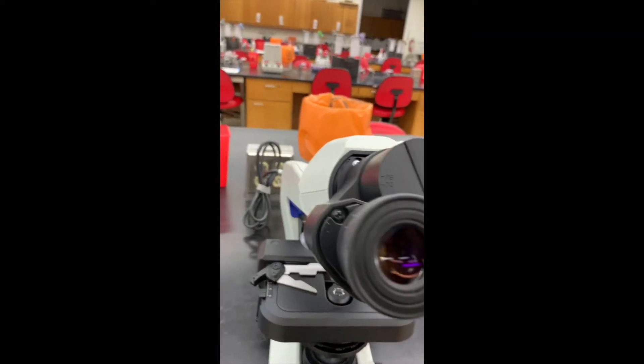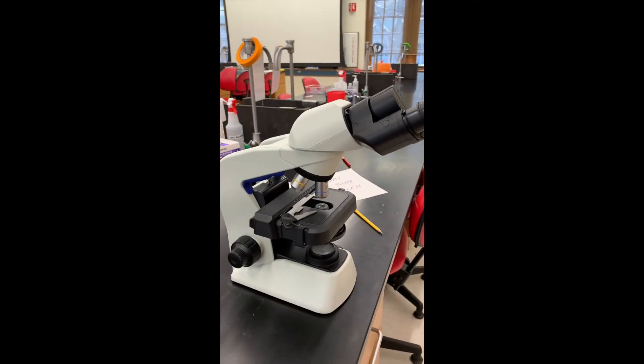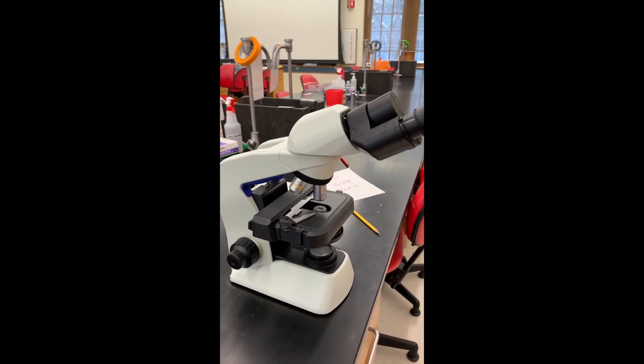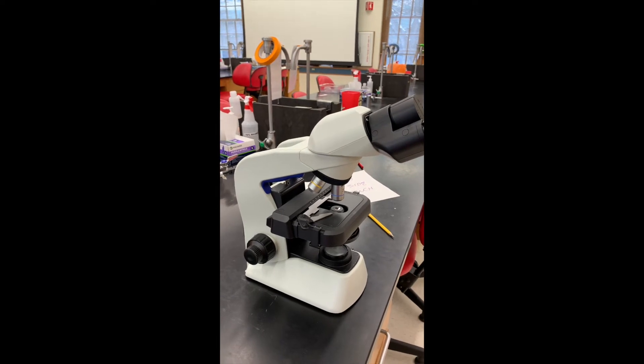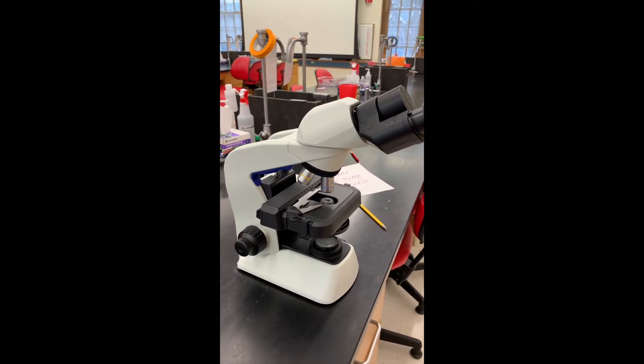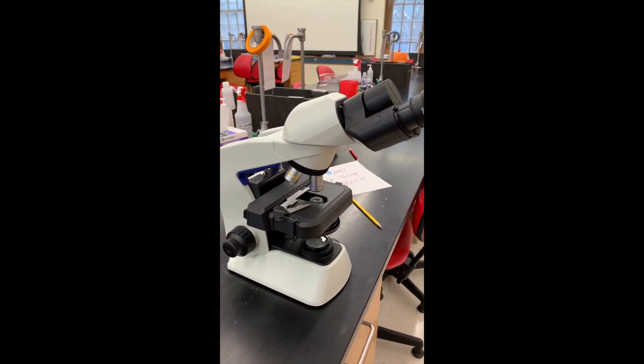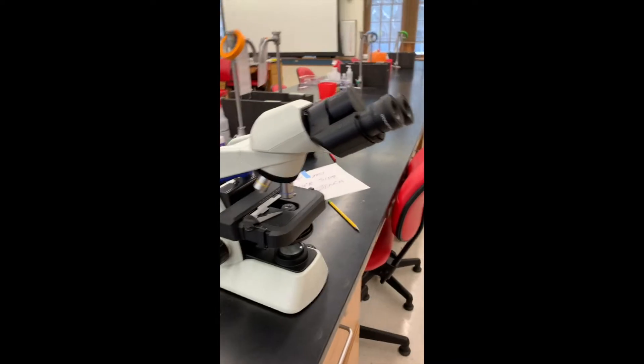That is all you need to know about our new microscopes. Hopefully this will help you in Unit 2 when we get to use the microscopes for the first time. I will also be posting a video about how you actually find your sample once you have stained your slide. Looking forward to it.